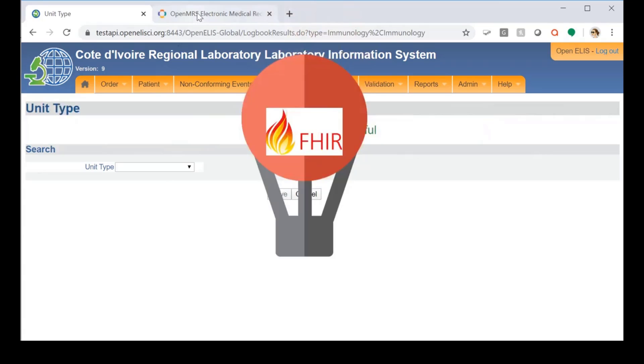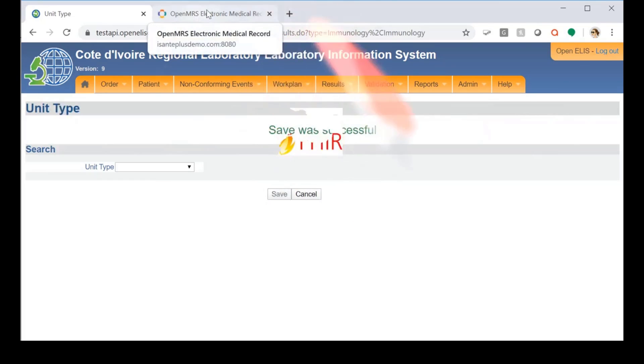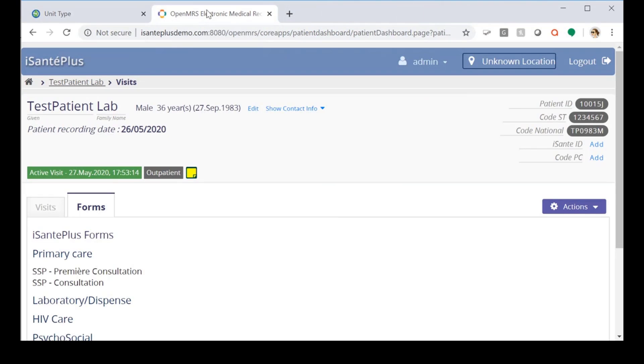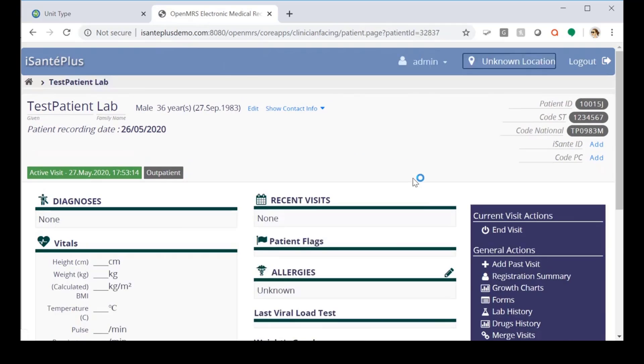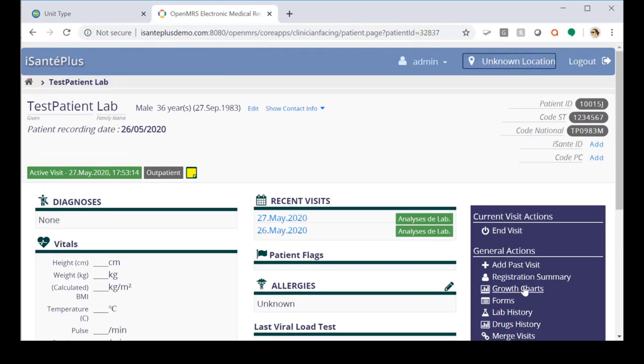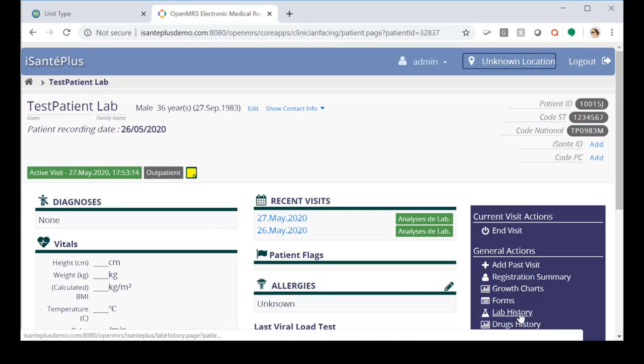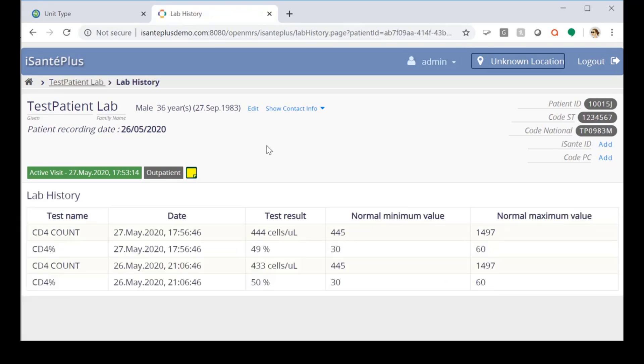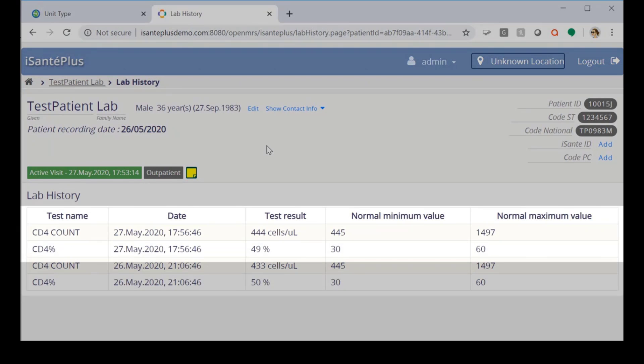Now once the test is saved, a diagnostic report FHIR resource is created that eSante Plus can then pull to display the lab results. So we'll look in lab history here. And here we're able to see the results which were entered in OpenELIS, which eSante Plus has now pulled.